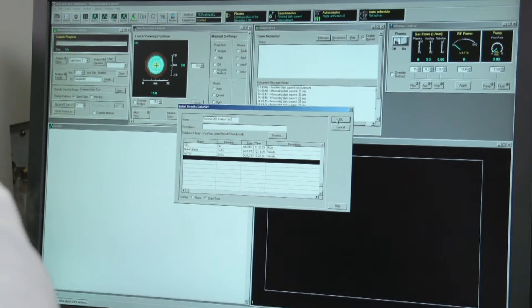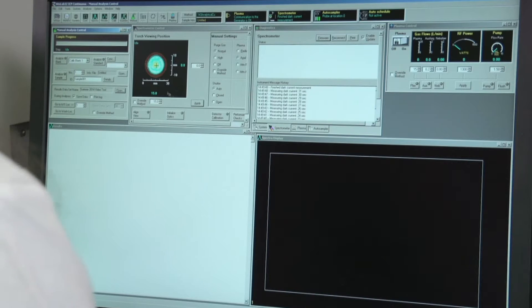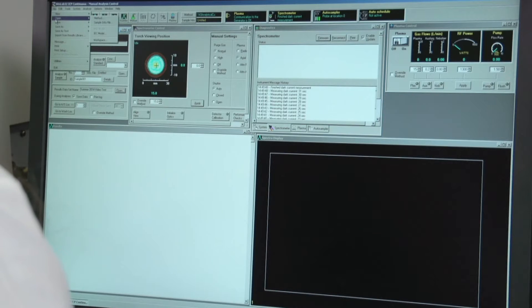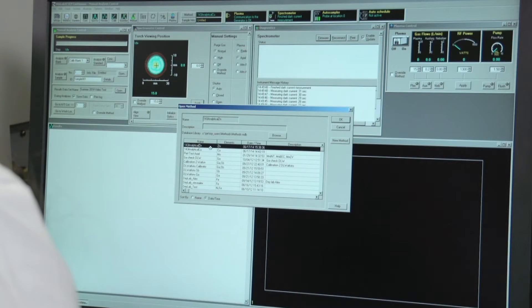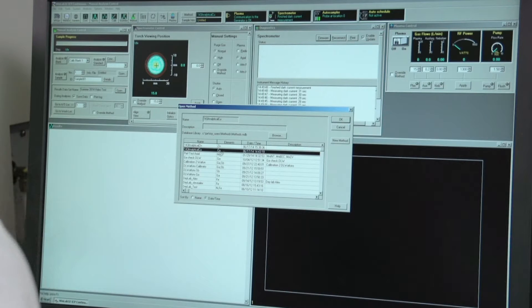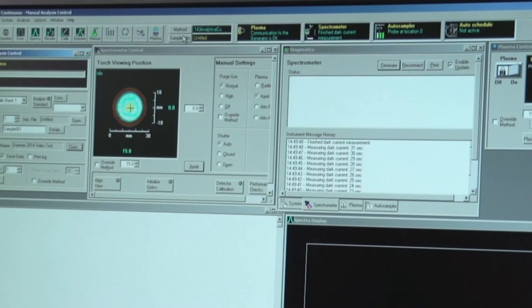Hit OK. The next thing you want to do is load the method. In the gray tab, go to File > Open > Method, and select 143 Analytical Copper to start with the copper method. Hit OK. To check that the method is properly loaded, in the method window you should see it says 143 Analytical Copper in the aqua text.